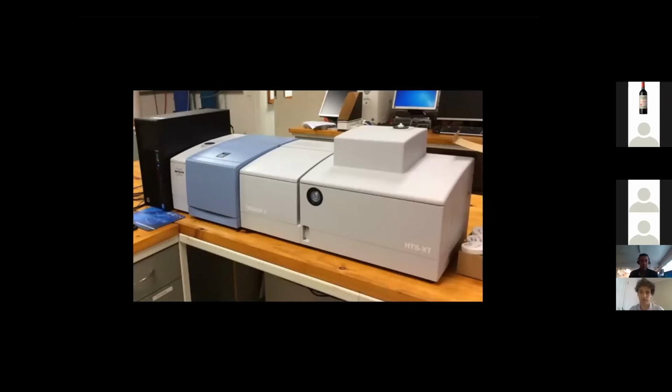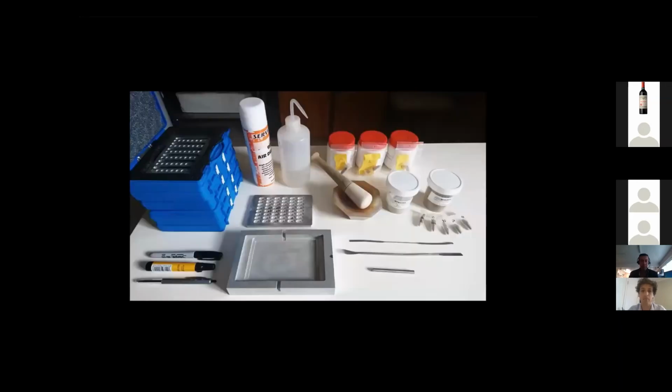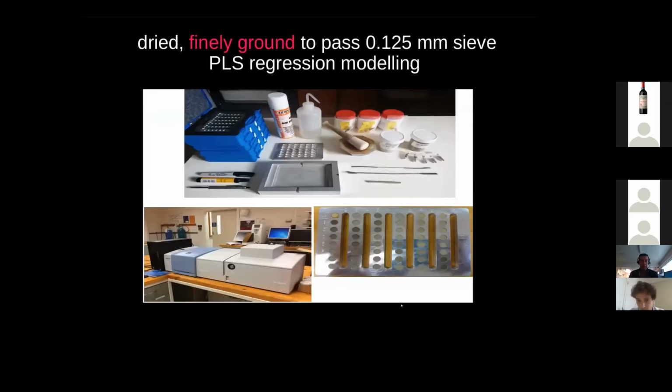That's the instrument. That's very much a benchtop instrument. You're certainly not bringing that one in the field. And because nothing is ever free in science, you have a much better signal, but sample preparation is a lot more involved. You have to finely grind the soil samples. You can't really just take a normal sample prep. You have to grind it a little bit more and put it in these little plates here. You can see here at the bottom that little plate that is then fed onto the instrument.